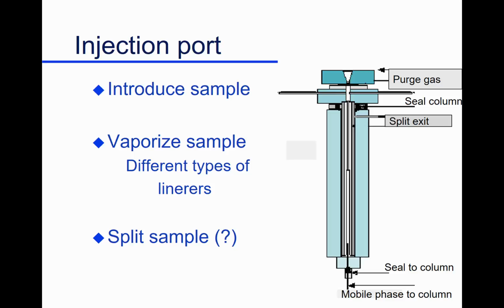But there is a gas seal up here. We've got to keep that gas online. We've got a rubber seal up here, and another seal down here, because this is a glass tube inside of a stainless steel chamber. Those two seals can be a place of leakage.